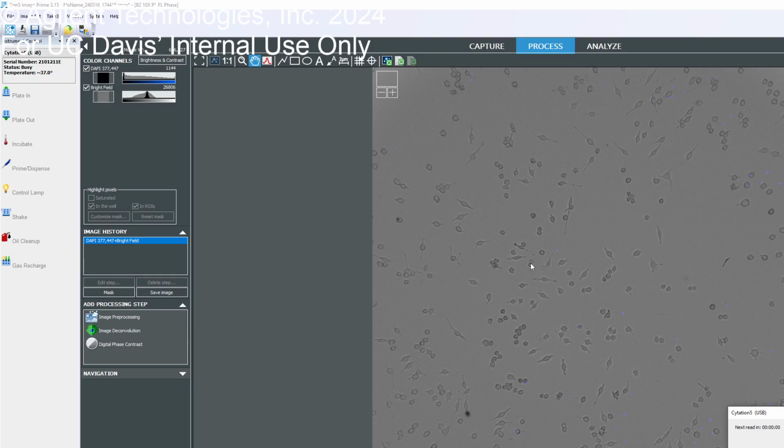Yes, you can even convert the read if you want, and then you can right click, create experiment that should retain all the information. Gotcha. And then just add multiple ones. Okay. Crazy. Oh, and it gives you a countdown too. Should I abort?